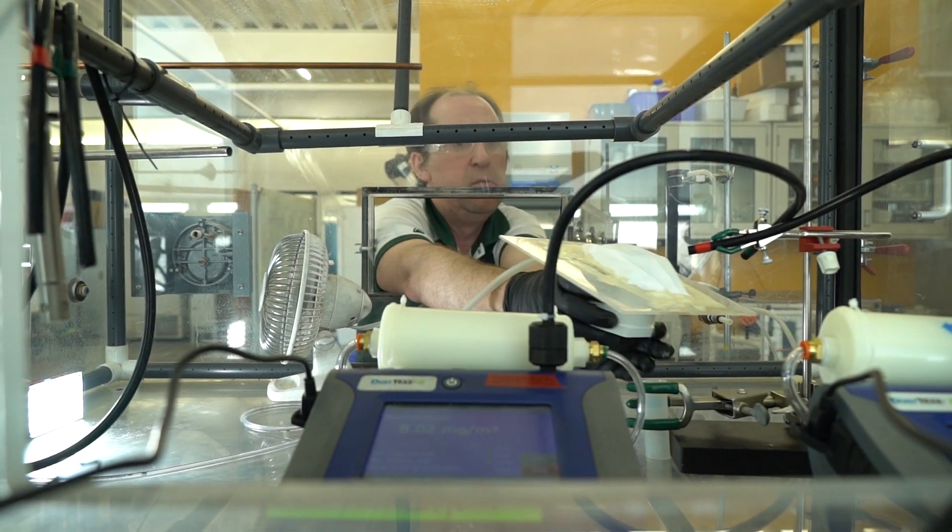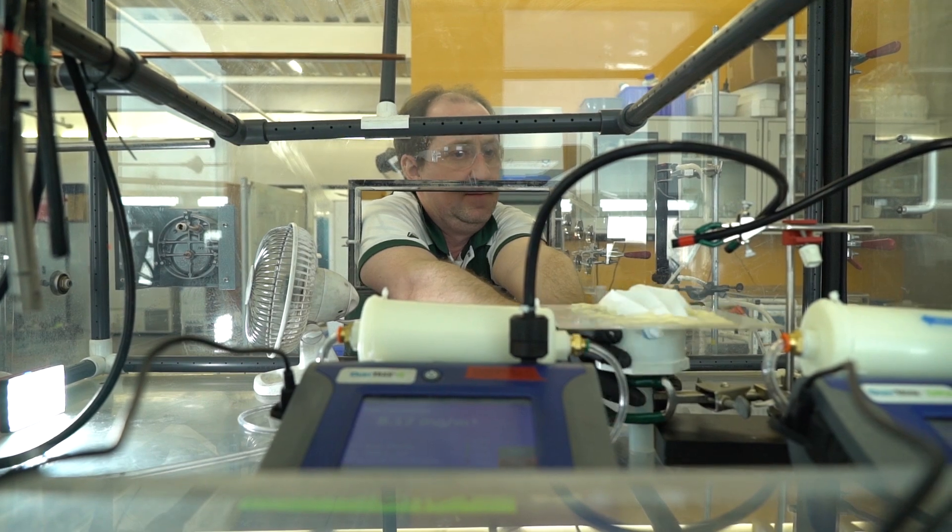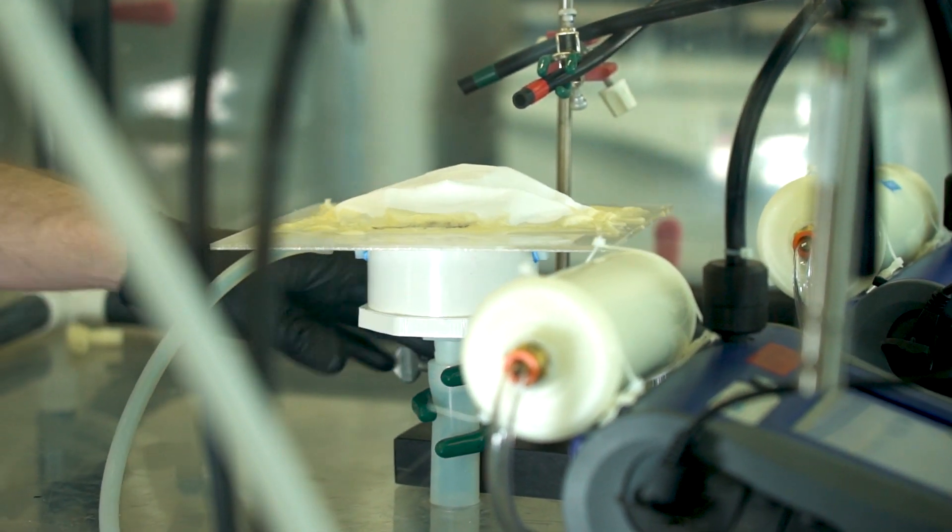Some of them have come from medical professionals who have a surplus and the state wants to verify they're doing well. We're also in the process of gearing up to do large-scale testing of big manufacturers to verify performance.